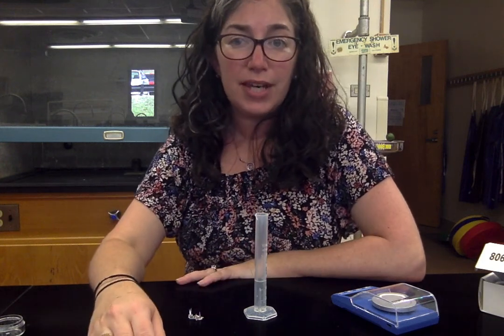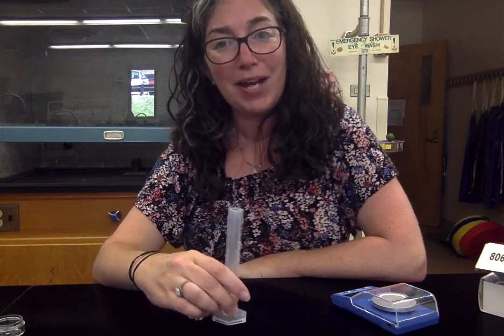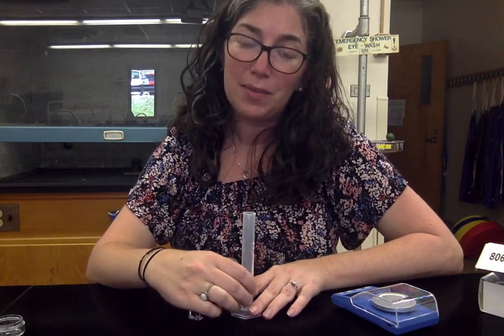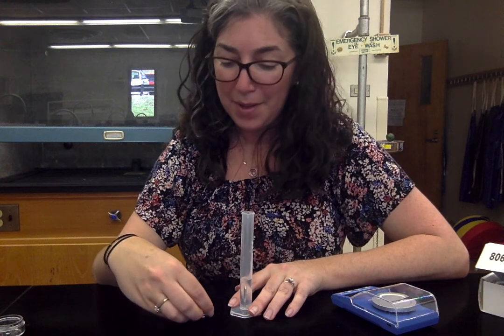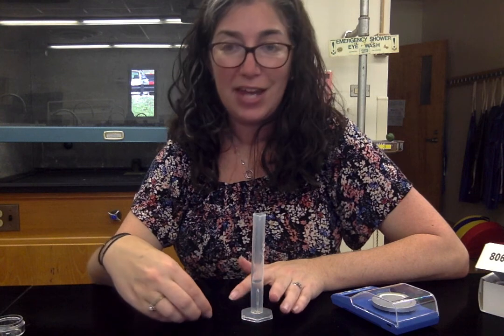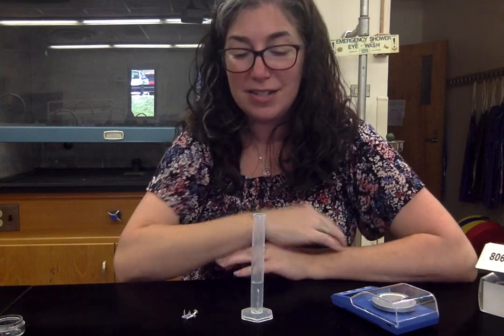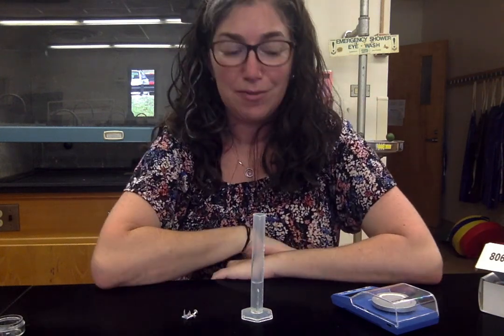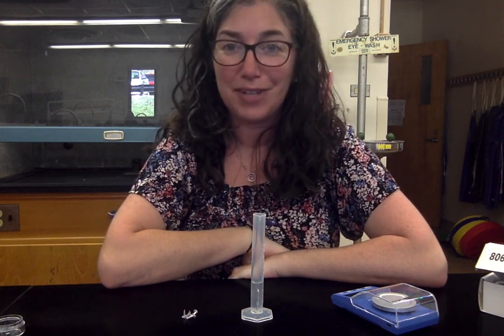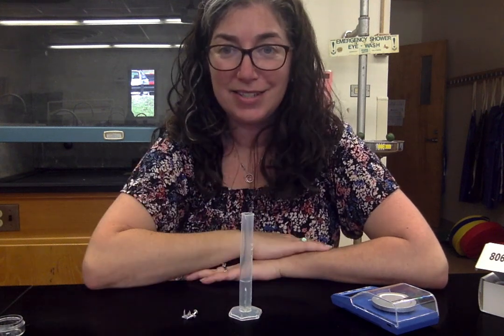Use those measurements — mass and volume — to calculate density, then compare your calculated density to the known densities of different metals listed on page one of the lab. You'll try to identify what type of metal each set of nails is made out of. You'll also calculate your percent error. This is not the most precise lab, so some error is expected and you will not be deducted for a high percent error.